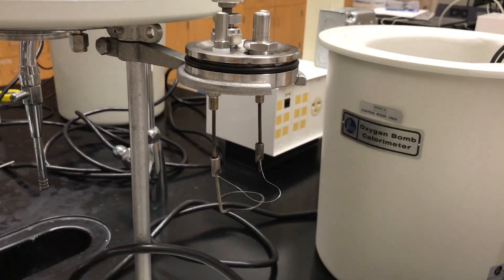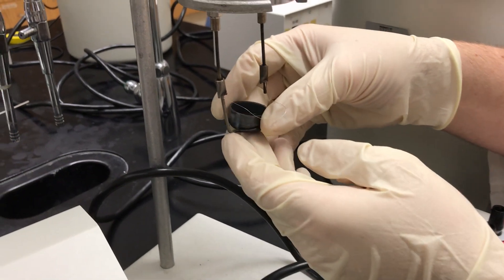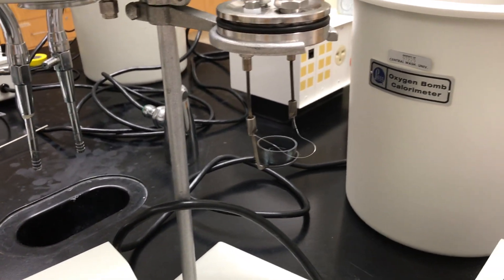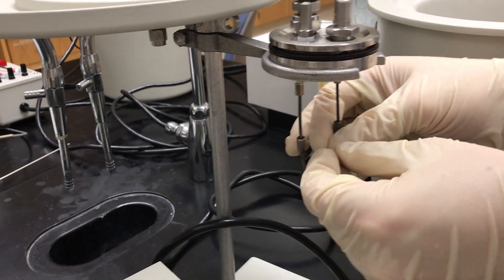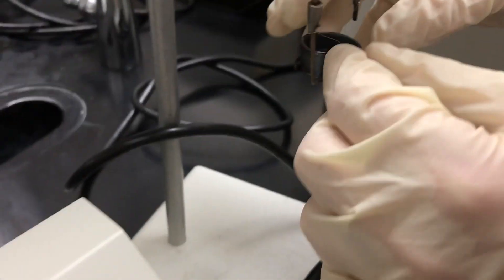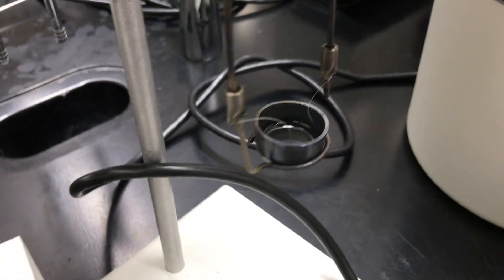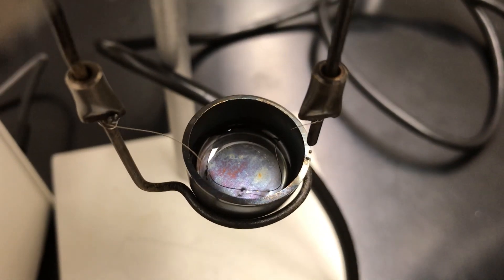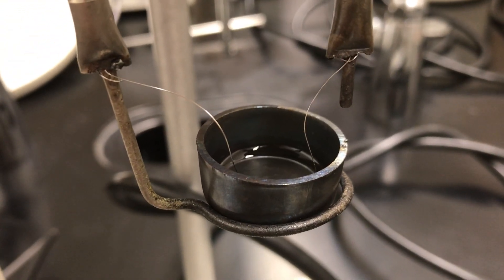Next we load the sample. We're using a liquid sample. For a liquid sample, we need to get the nichrome wire to just barely touch the top of the liquid — it can barely be submerged. Otherwise the sample will not ignite properly. For solid samples, you want to make sure the nichrome is pressed hard into it. As you can see, the wire in there is just barely touching the top of the liquid sample — that's just how you want it. Also make sure the nichrome is not touching the two sides of the sample reservoir.